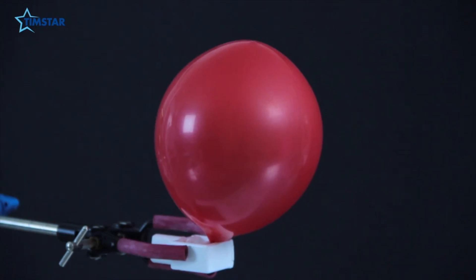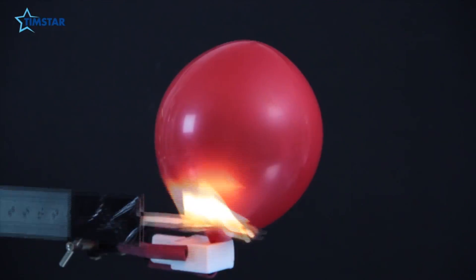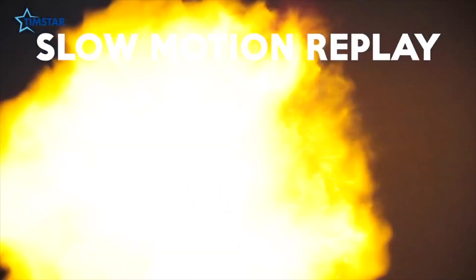Here we are — we're all set up to set light to the balloon. Inside here should be a mixture of hydrogen and oxygen which has been split apart from the water. Set light to my splint. Wow — that is a huge explosion from a tiny balloon! What's really beautiful about this is that the explosion of the hydrogen and the oxygen together makes water. It's a beautiful cycle.